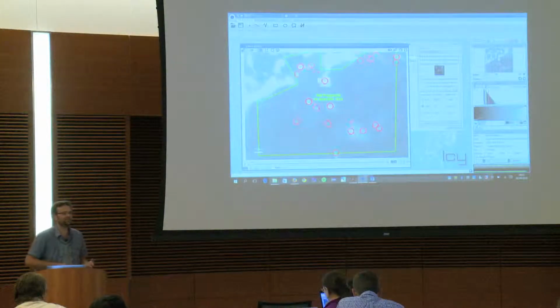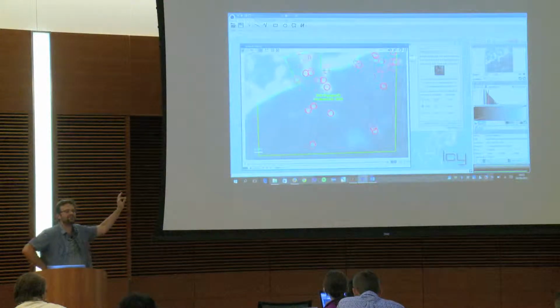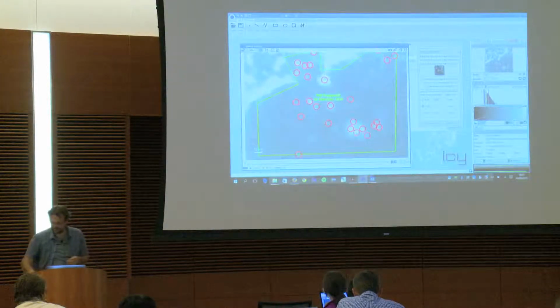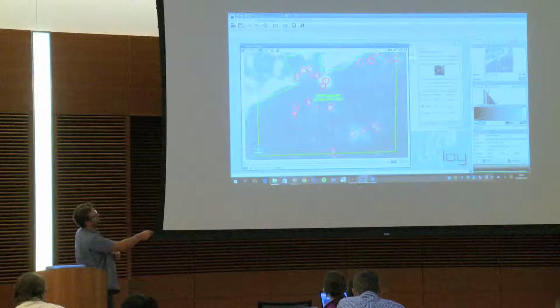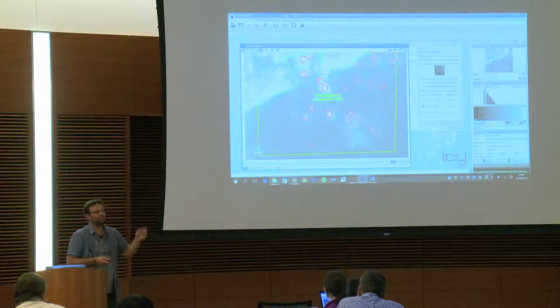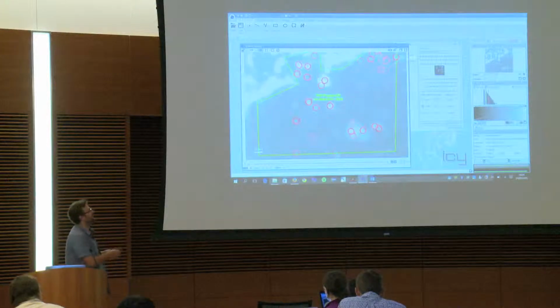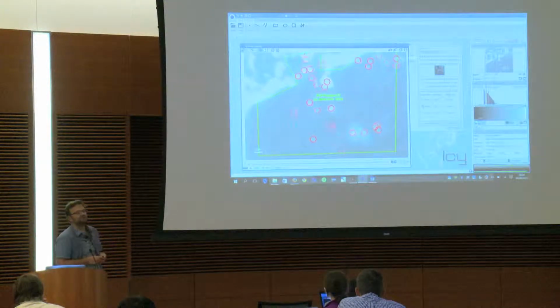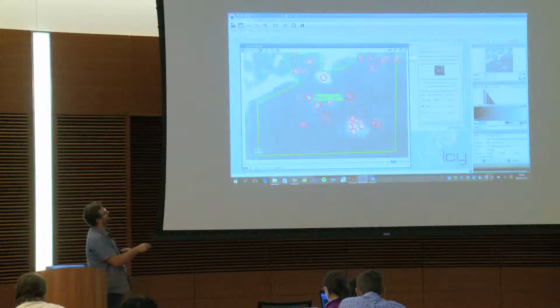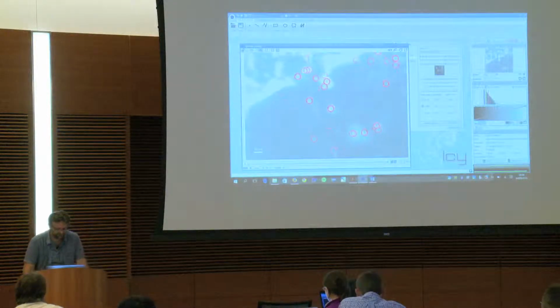The problem that we're facing here is the problem of tracking: you have those dots that are appearing, but for specific t. There is no connection in time, okay? There is no wire in time. And it's difficult because if you look at this location here, for instance, it's blinking a lot because we cannot be completely confident in the detector. Or maybe because the vesicle is going deep in the tissue, we don't see it anymore, maybe it disappeared behind something. So in fact, we can model the confidence that we have in our observation, and this will be reflected in the algorithm. Okay, so now I don't need my ROI anymore, and I will launch a tracker.